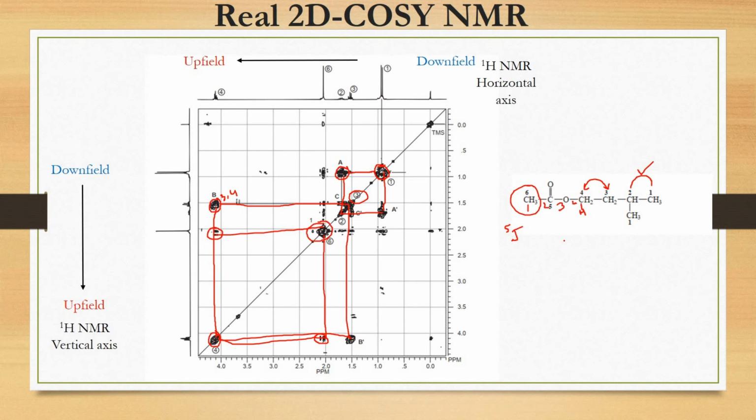It means that when the molecules come in close proximity, there could be an interaction like hydrogen bonding or some other weak bonding interactions, and that could transfer the effects from one bond to another bond, and this could lead to the formation of weak signals. And you can ignore those weak signals. We just have to focus on the strong, intense spots.